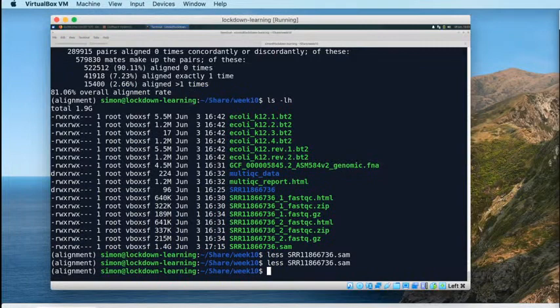That is because the FASTQ files have been compressed, so we've compressed that text FASTQ data with gzip compression. At the moment, the SAM file is just plain text, and so we could compress it in the same way as the FASTQ is compressed using gzip compression, and that would make it smaller.